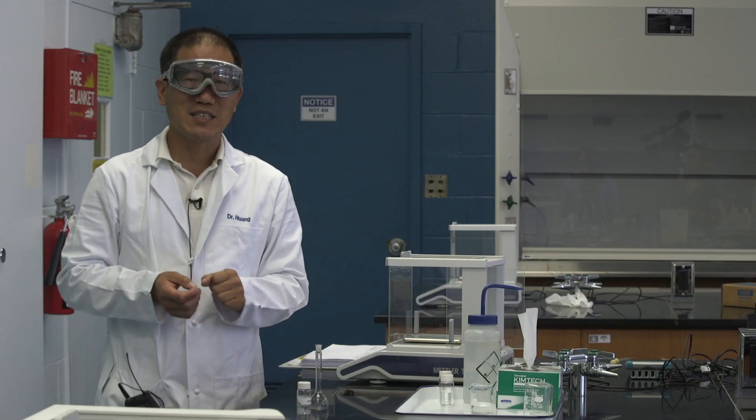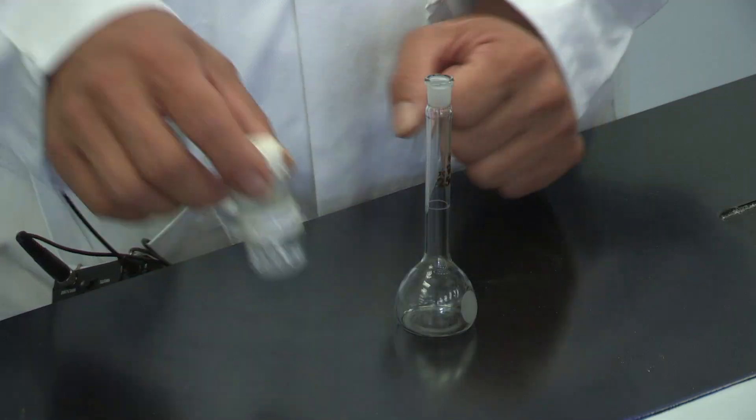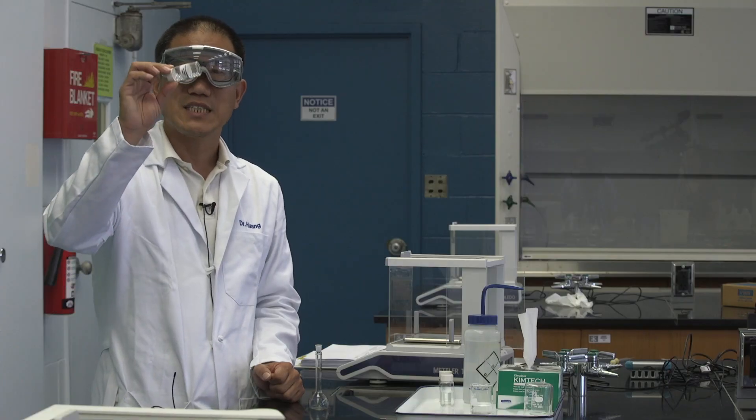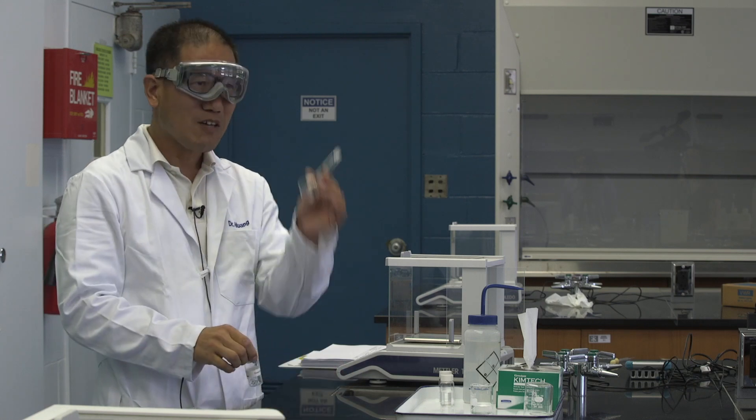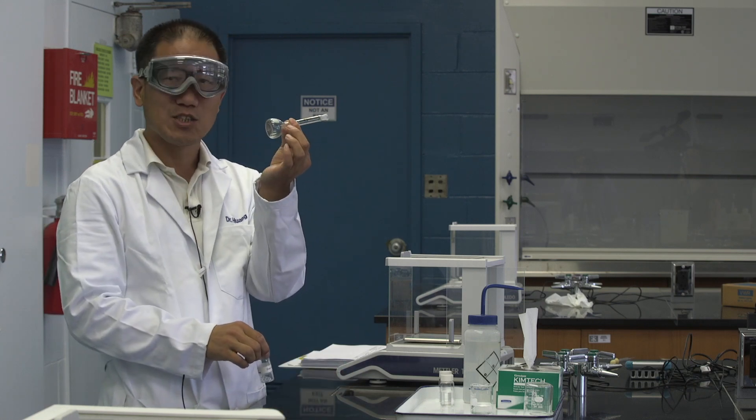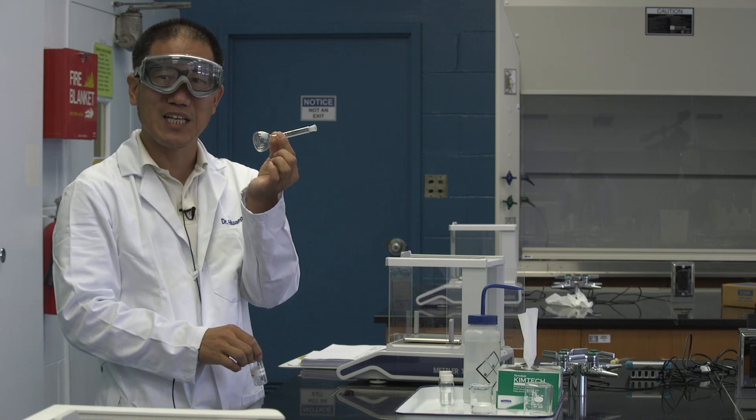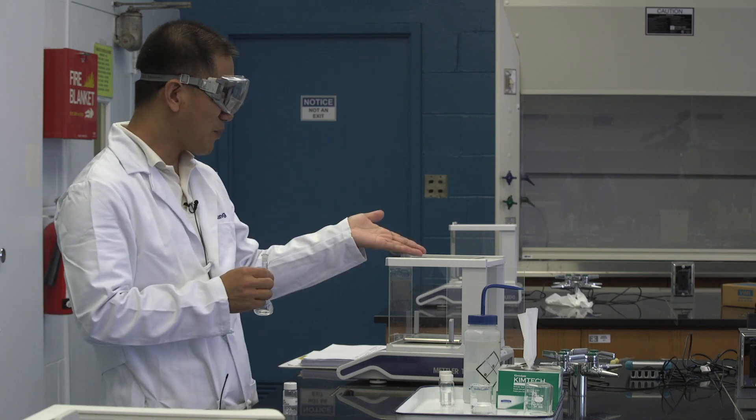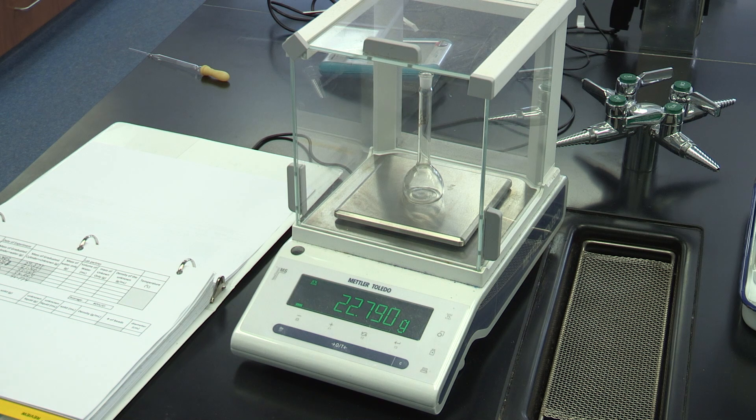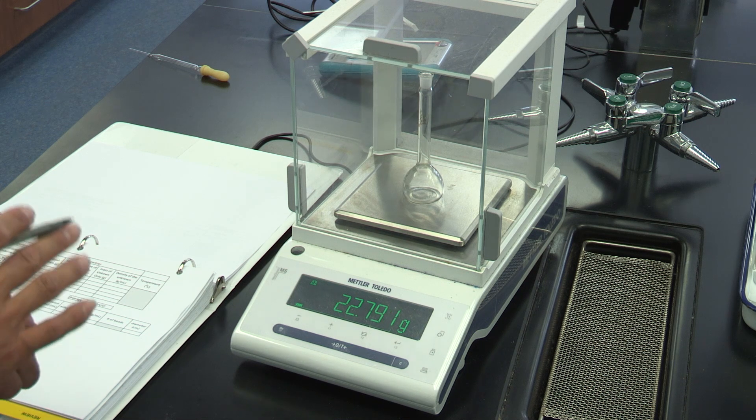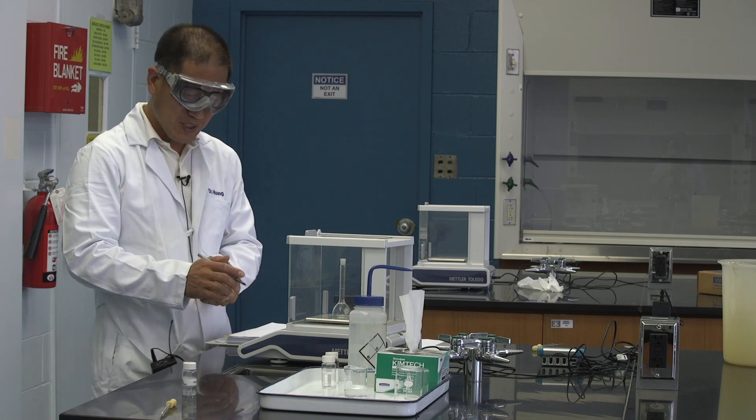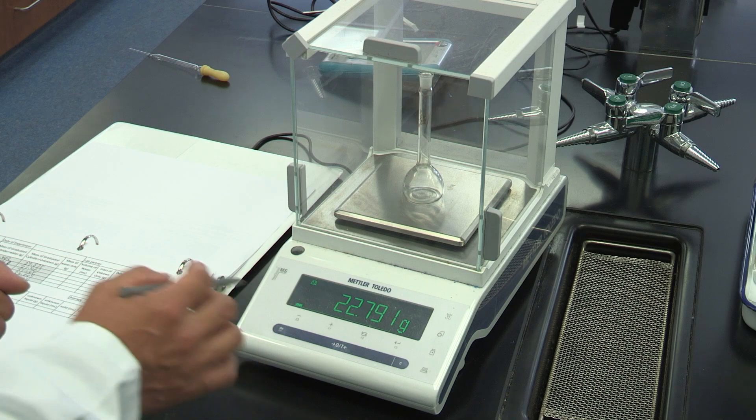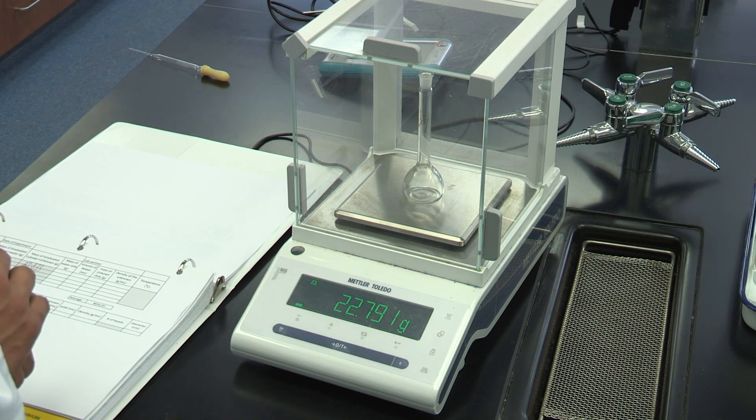For the second part of the experiment, we are trying to determine the density of the unknown insoluble solid, which is in this vial. With the volumetric flask, which is 25.00 milliliters and the electronic balance. First, let's get the mass of the empty volumetric flask. With the method I just told you. The mass is 22.791 grams.